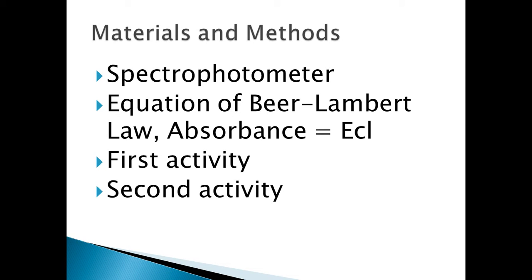By testing enzyme activity in cuvettes at varying pH, we determined the optimum pH. For each cuvette, a different pH was given from 3 to 10, and they were observed for 2 to 3 minutes with 30 second intervals. The optimum pH was the pH where the rate of reaction was highest.